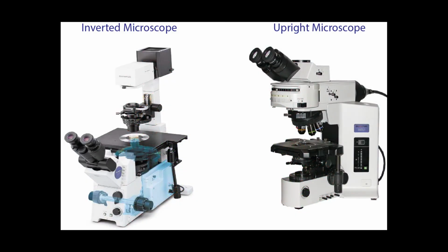In this training video, we are going to teach you the optical components and light pathways of microscopy and the differences on a basic upright versus an inverted microscope.